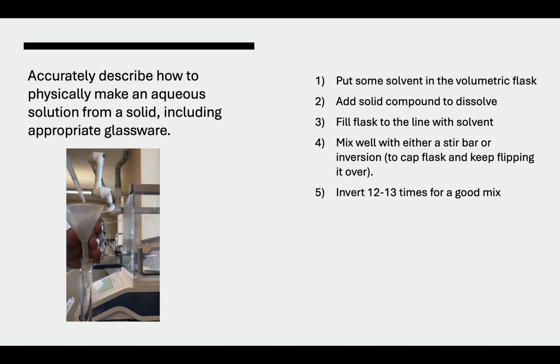A lot of times there's sugar stuck to the sides of the funnel, so you just want to rinse that out.